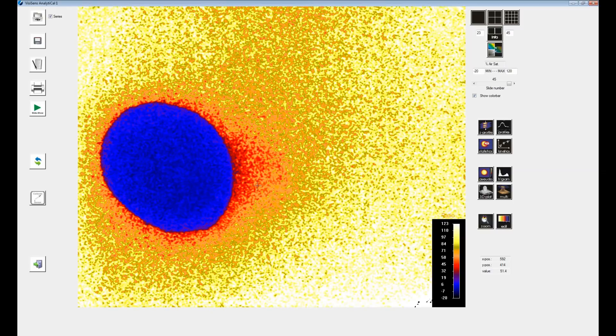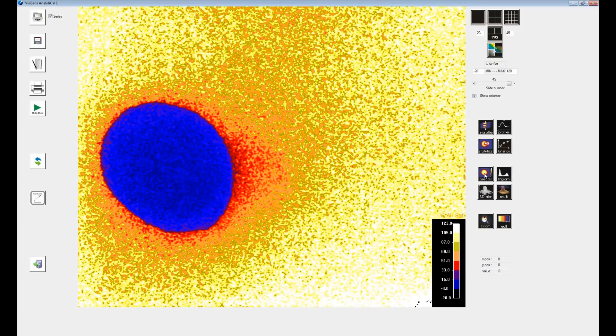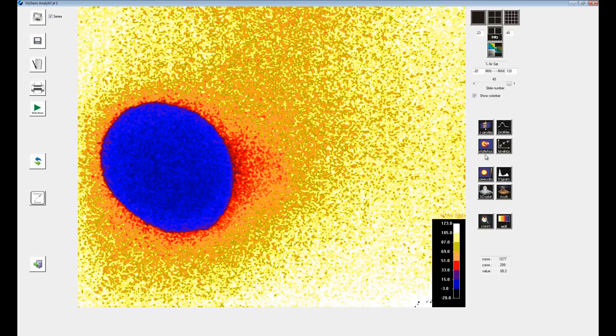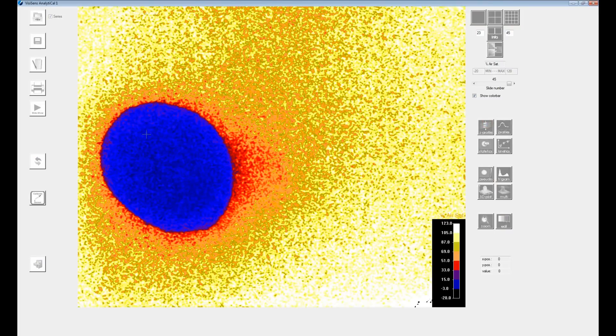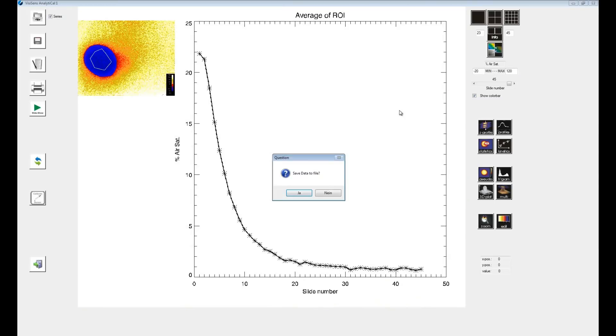Clicking on the display function will change the color bar to show percent air saturation. If you do z-axis profiles again you can see now how the oxygen value inside the sodium sulfide drop decreased towards 0% air saturation over time.